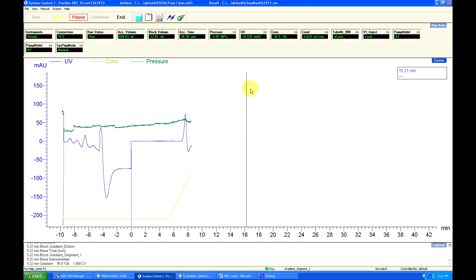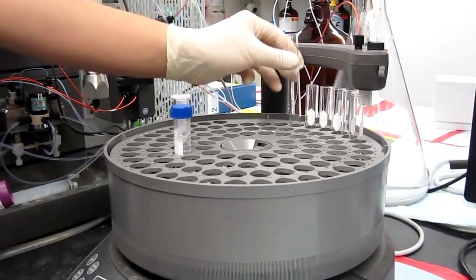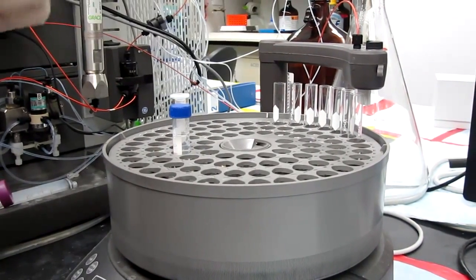Now we are nearing the part of the run where our sample elutes, and we want to collect the peaks. Make sure there are enough test tubes for the amount of fractions that you are going to collect.